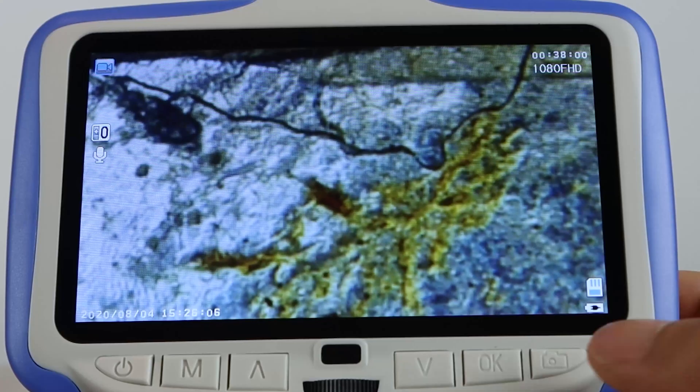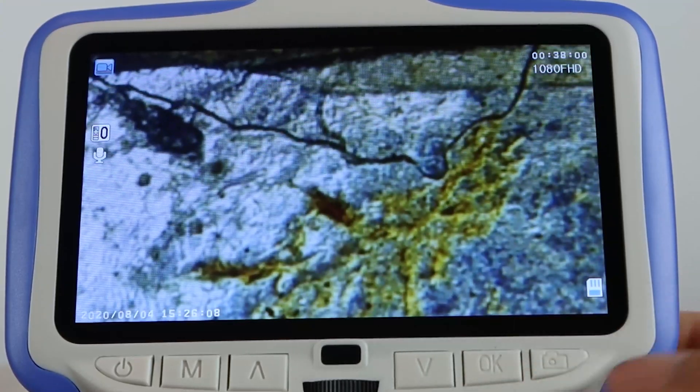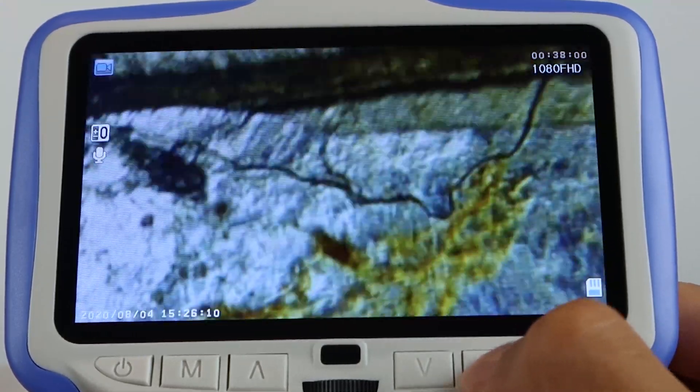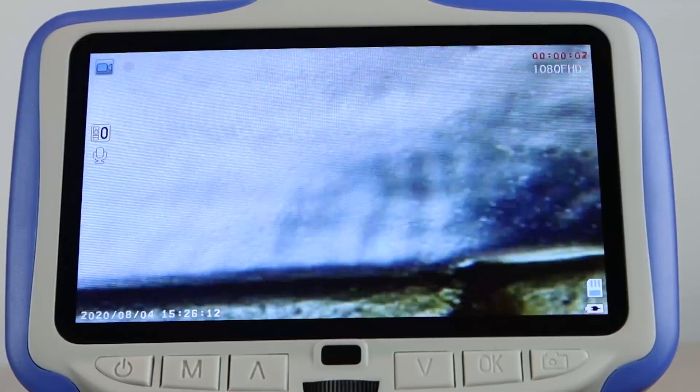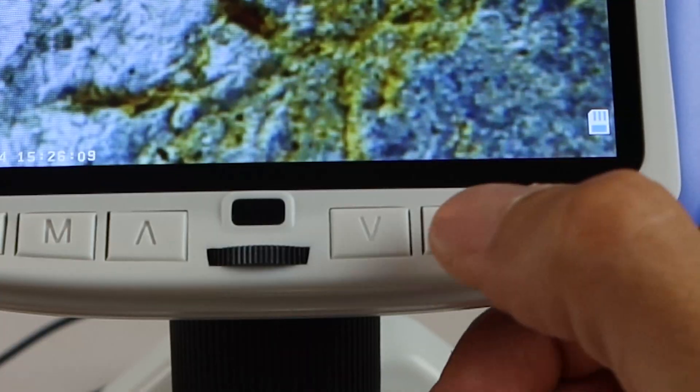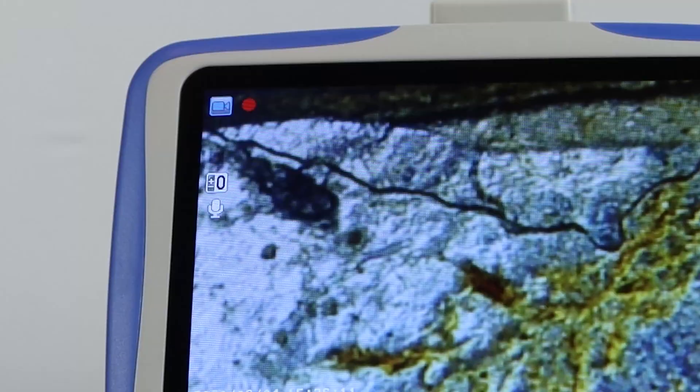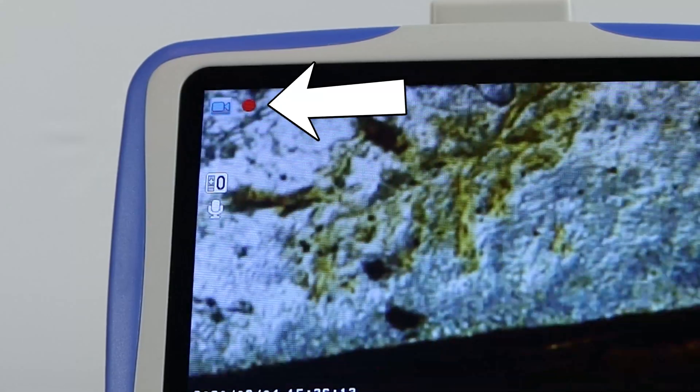It's important to note that the photo button doesn't actually do anything when you push it. To take a photo or video of what's happening on the screen, you actually have to press the OK button. And now you can see, in video mode, that it is recording.